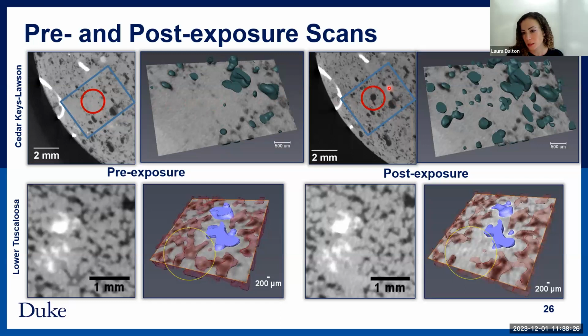So we're actually seeing porosity developing with time as it's submerged in the CO2 saturated brine for six months at these really high temperature and pressure conditions. Whereas for the sandstone, we see that there's a pore here that is actually closed over that six months. So that's precipitation. And it's really just showing another way you can study something with tomography.